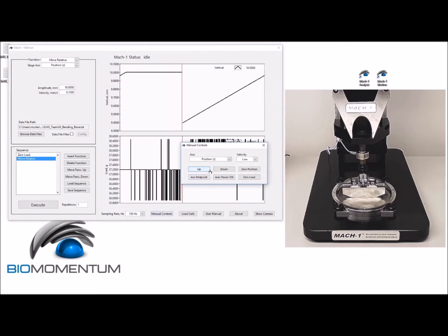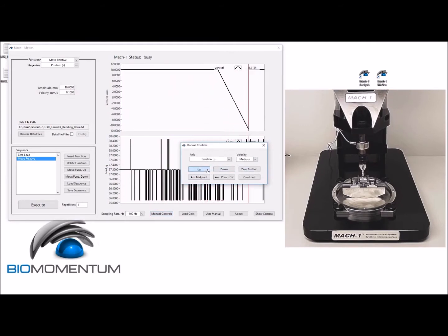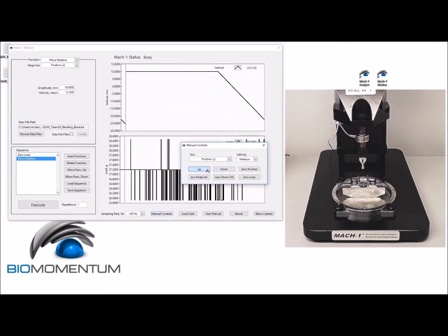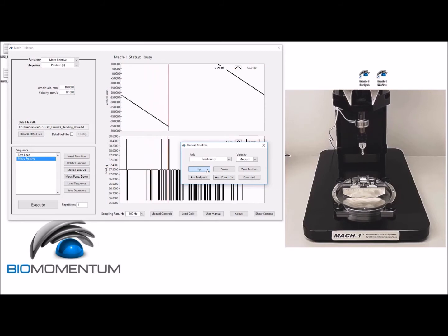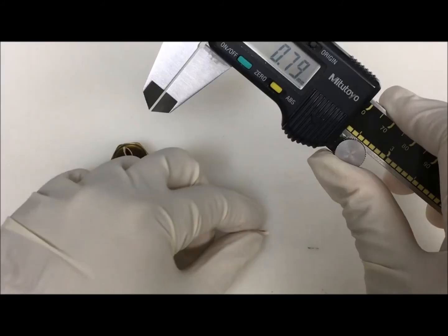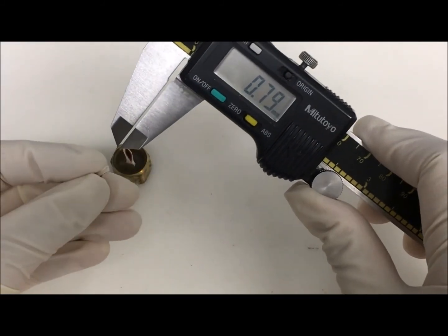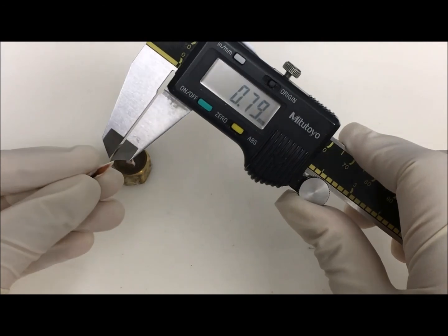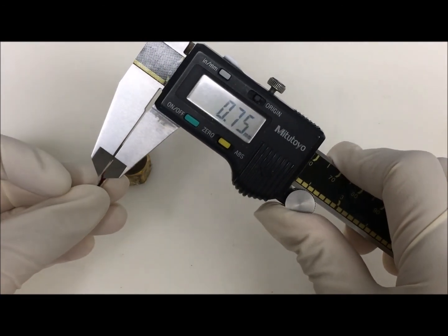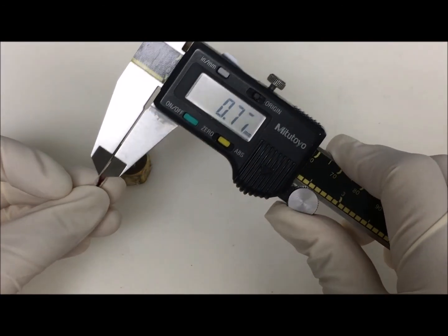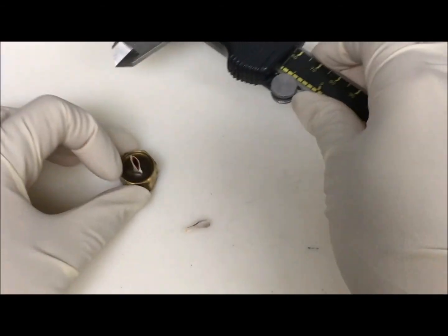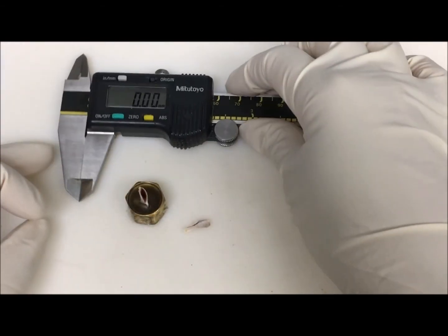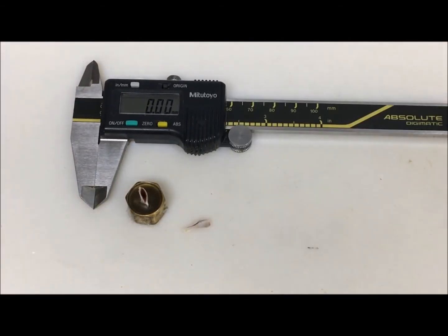Then using manual controls, raise the stage to approximately 50 millimeters above the sample. Using a caliper, measure the wall thickness of the cortical bone after the femur has experienced failure and report the value. You can now dispose of the sample.